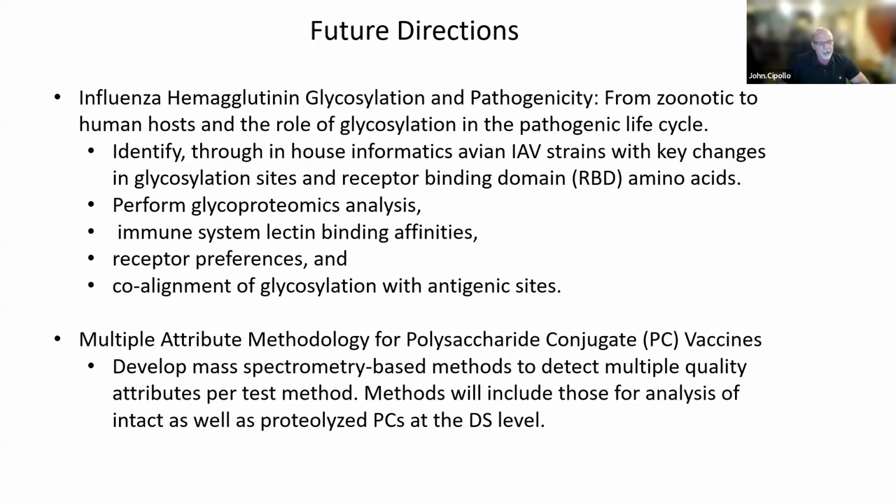We're performing glycoproteomics informatics analysis for reasons I've already described. And we're also going to look at immune system lectin binding affinities. And we have partnered with Maurice's group, who's actually at this talk, and we're really looking forward to looking at some of these in our SPR setup with our collaborators here at FDA. And then receptor preferences. So we have collaborations with two different groups to do glycan array. And so we were hoping to see differences in RBD, and then co-alignment with glycosylation and antigenic sites. So that's along the lines of what I've already described to you.